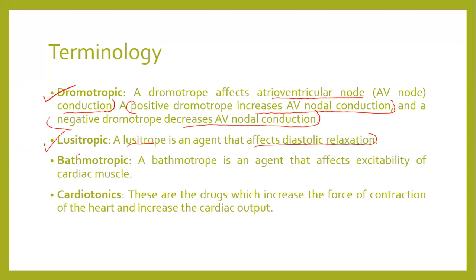Okay, then we have the bathmotropic drugs. So what is bathmotropic? It is an agent that affects excitability of the cardiac muscles.